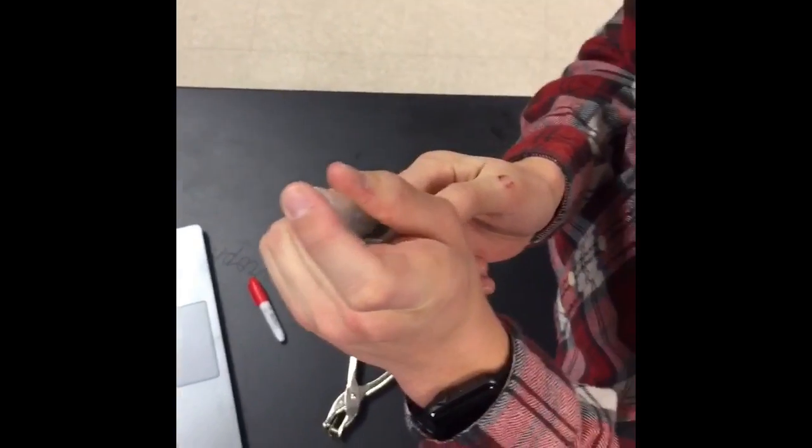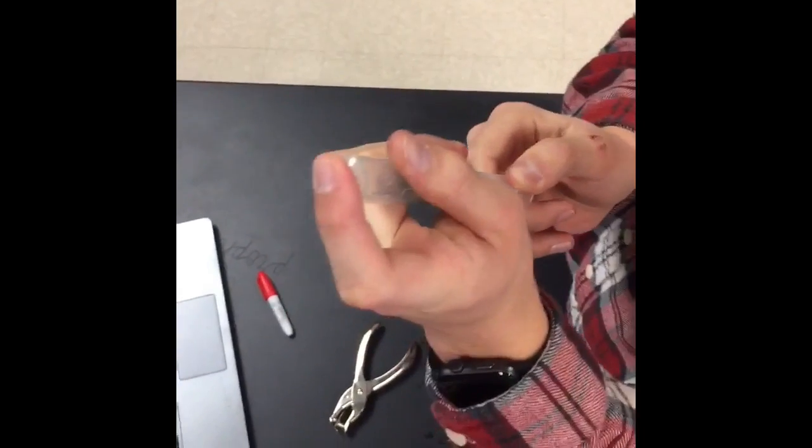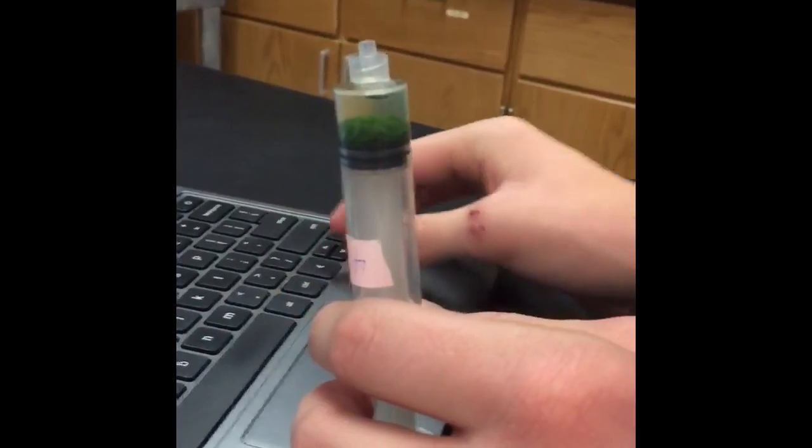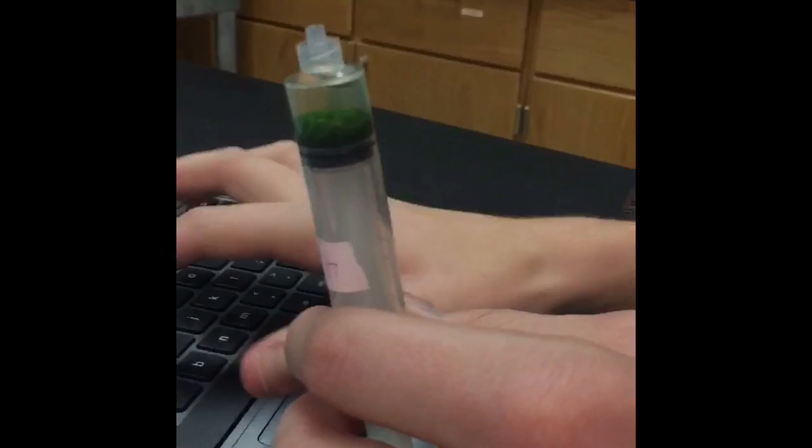There's like a vacuum kind of. Do I just hold this here? What is this called? Making a vacuum. So the discs sink to the bottom, and now they're floating. All 10 discs have sunk.